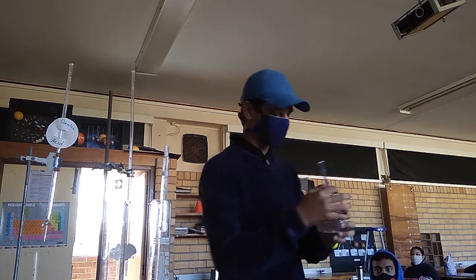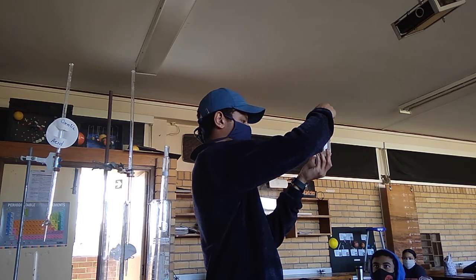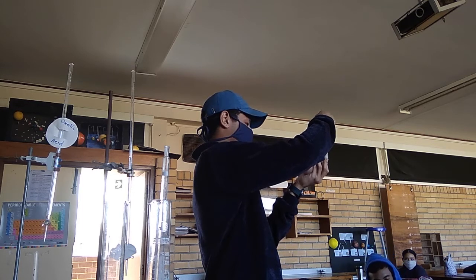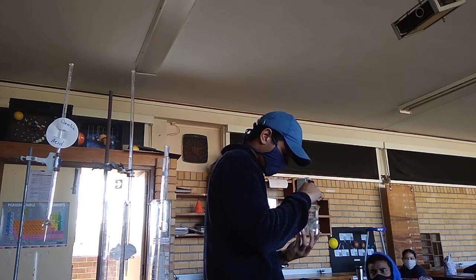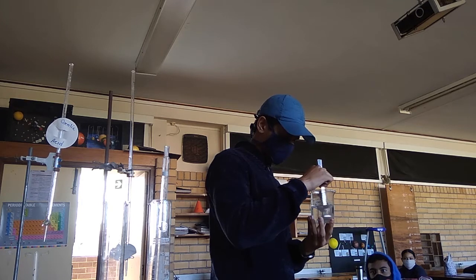Now just see if sodium hydroxide dissolves easily. How long is it going to take to stir that up? We can never work with a solution that's got a solid lump in it. Who can tell me why? Why would we never work with a solution until every lump is gone? Because what's going to happen when we walk away and leave the lump? After a while, what's going to happen to the lump? It's going to dissolve and become a stronger solution. So we must start with a solution that's got a known amount in it, and it must all be dissolved.